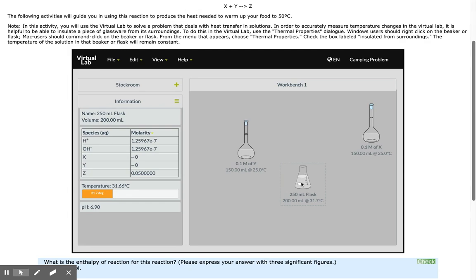Now you can perform your calculations to determine the enthalpy of this reaction.